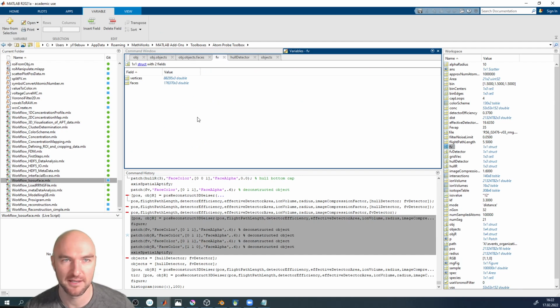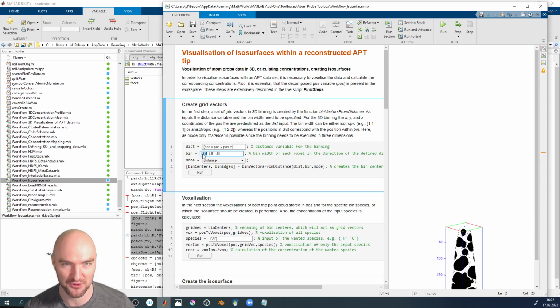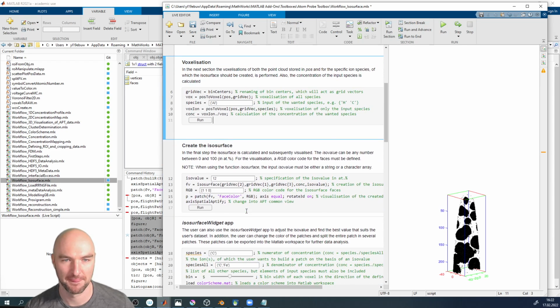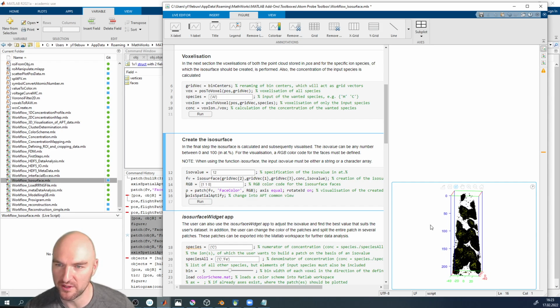Where is it? It is here. You can see it's a much larger file now. Maybe 1.5 nanometers was pretty fine. Let's just rerun everything with a wider voxel size. So let's rerun everything with 3 nanometer voxels. This will give us a much less noisy isosurface with a lot fewer vertices.